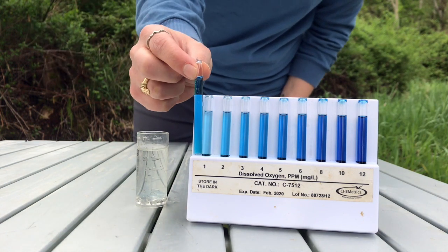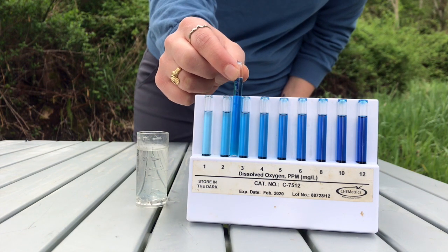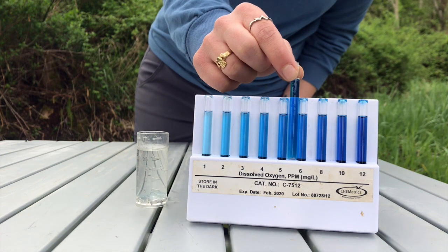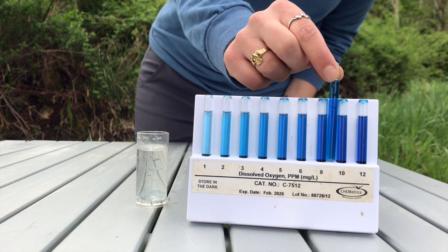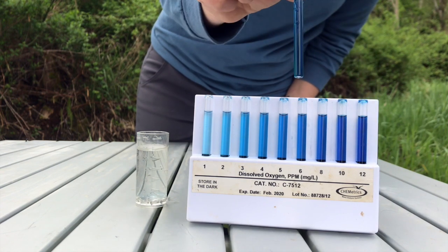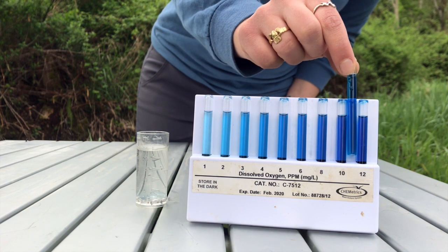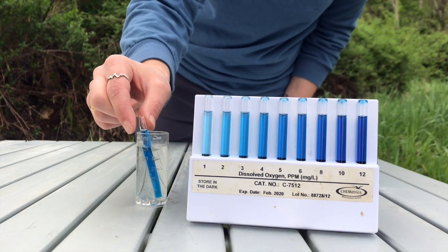So now we need to compare our sample to the shades of blue in the standard in order to determine our DO level in parts per million. Based on what I'm seeing, it looks like the DO level of Jones Creek is somewhere around 8 to 10 parts per million. But we'll go ahead and take a look at some of these upper numbers again. Go ahead and record our results on your worksheet and circle whether or not we met the Salmon Standard.